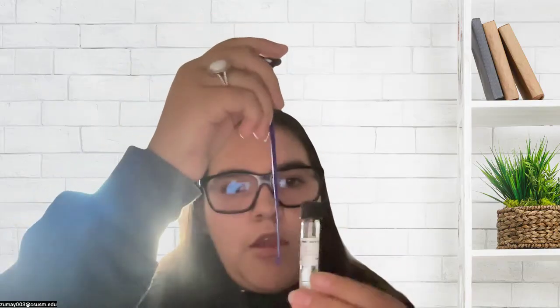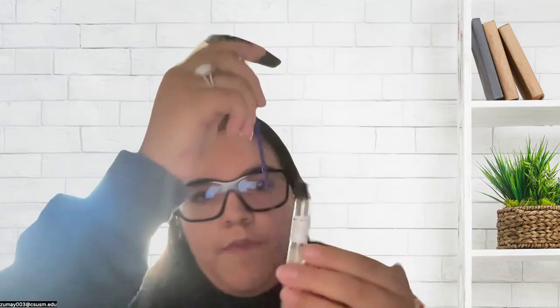Next, you are going to take an inoculating loop such as this one, and you're going to be placing it inside the cup with the isopropyl alcohol. Taking the tea light, place the loop above the flame to make sure that you're burning out the alcohol and making sure there's no contamination. Once this is done, you are going to make sure that all the isopropyl alcohol is off of this, and you're going to insert the inoculating loop inside of the test tube, and mix it to make sure that all the microbes are on the loop.